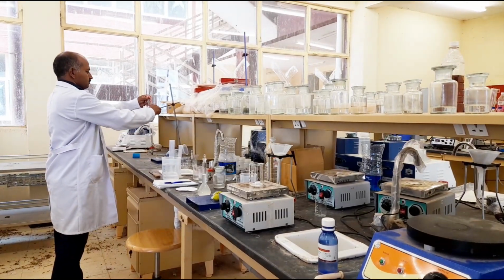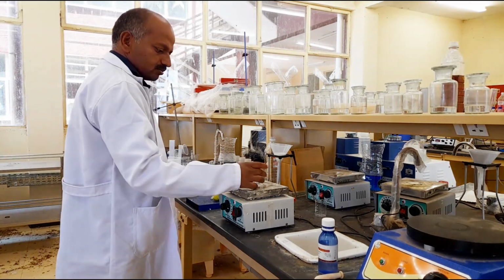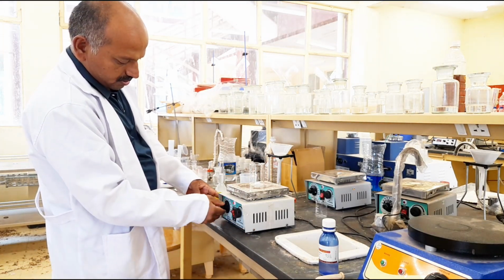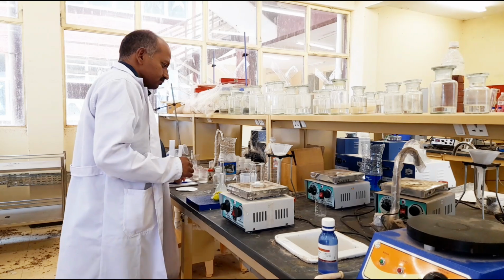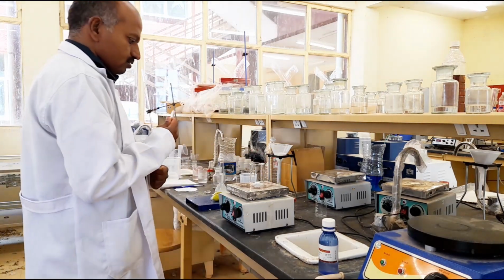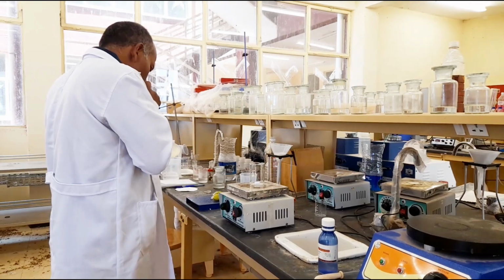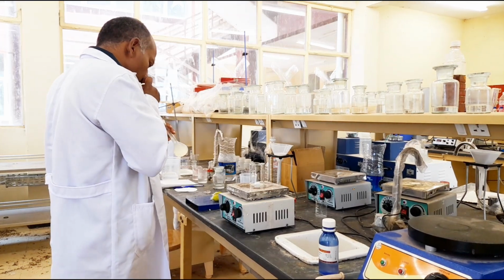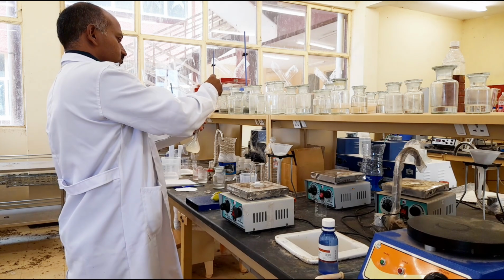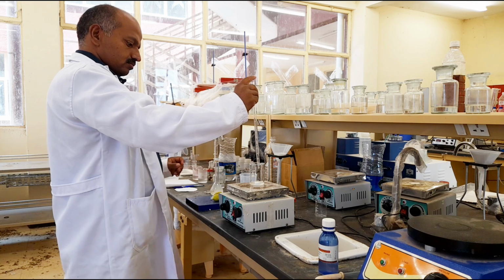Now I will take this solution, 10 ml, into this beaker containing the magnetic stirrer. This is the magnetic stirrer instrument, which is ready. Now I will take 10 ml of this into the beaker. This is 10 ml.